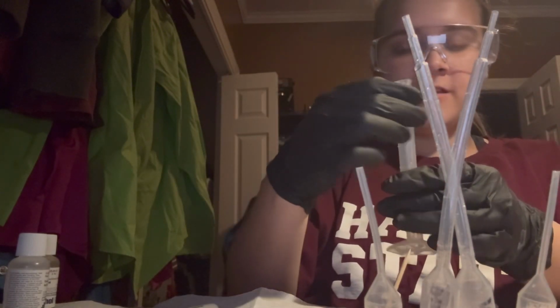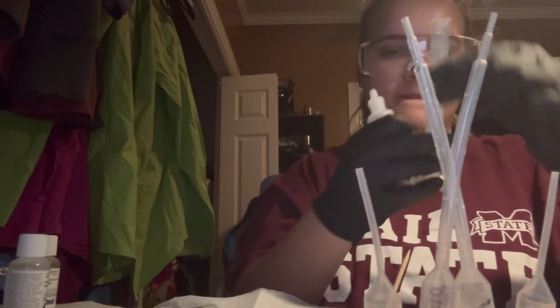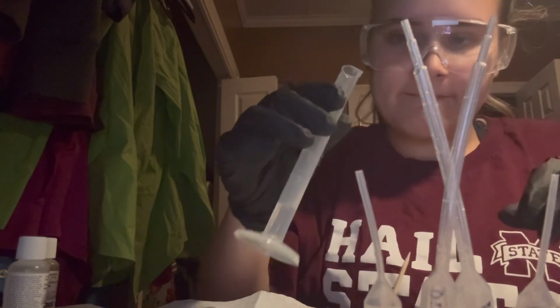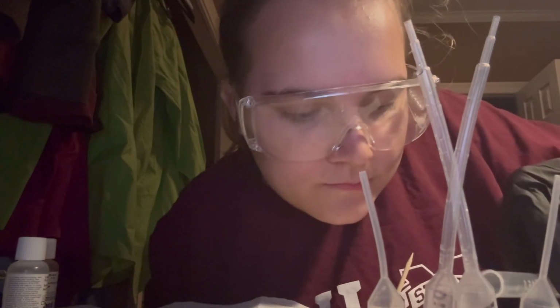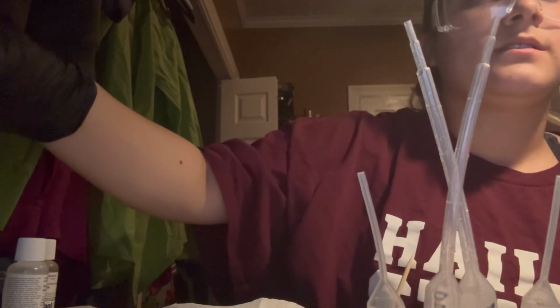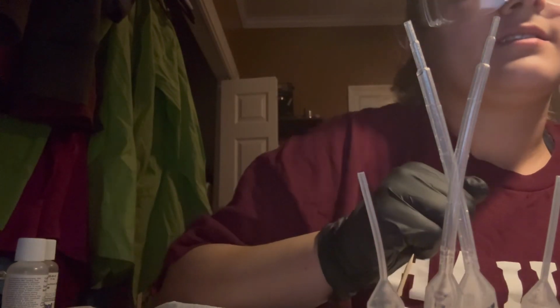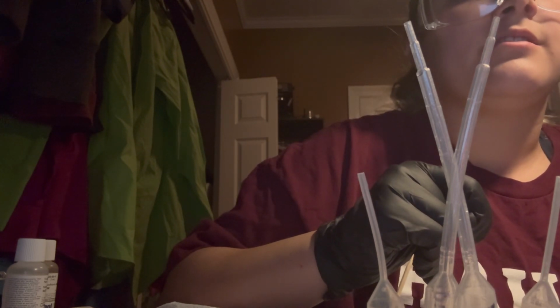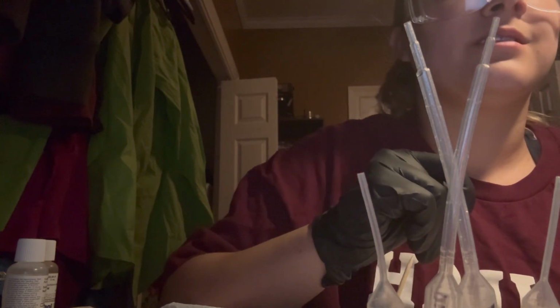So now we'll be adding 2 milliliters of distilled water to well D1, which is right here. I'll be using this graduated cylinder to measure 2 milliliters of the distilled water. It says to put it in well D1. Alright, on to the next step, which says add 1 drop of 6 molar HCl to the distilled water in well D1 to create a 0.1 molar solution of HCl.